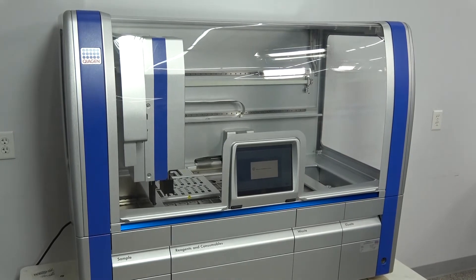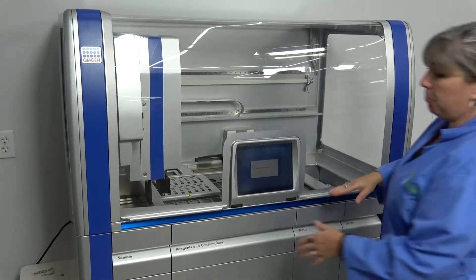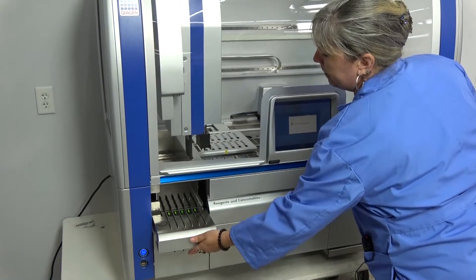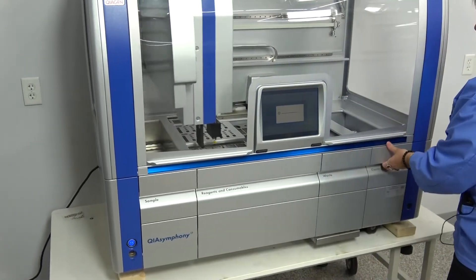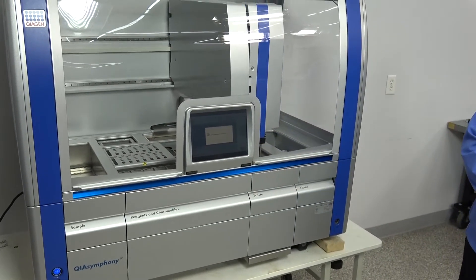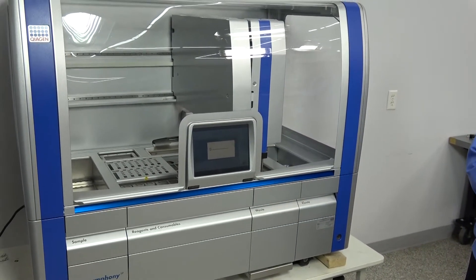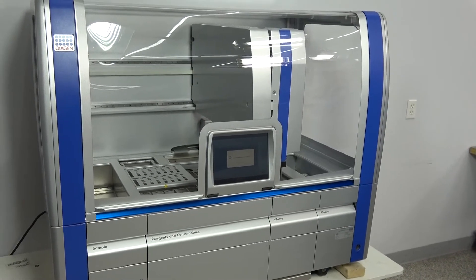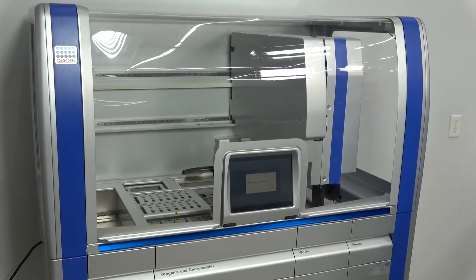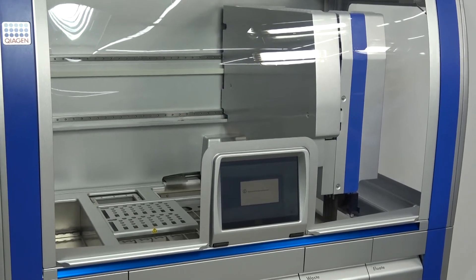You can load samples while the instrument is in process. In this door right here, the racks slide in. The other doors are locked and will not open while this is moving. Cartridge kits are available from Kaigen. These cartridges are prefilled with the various reagents that you'll need for your processes. Four different protocols can be loaded at once.